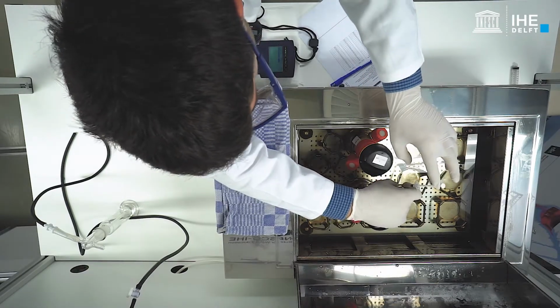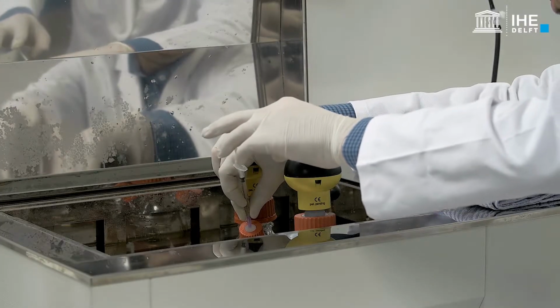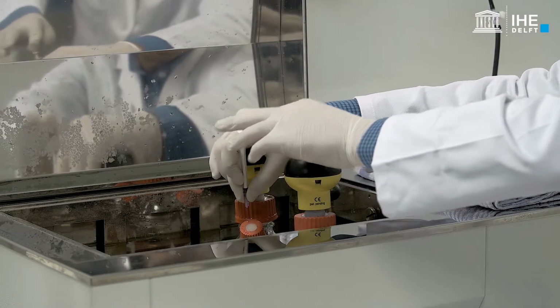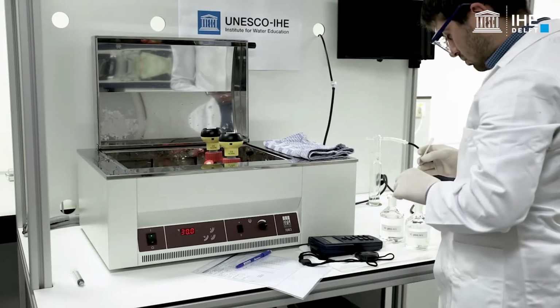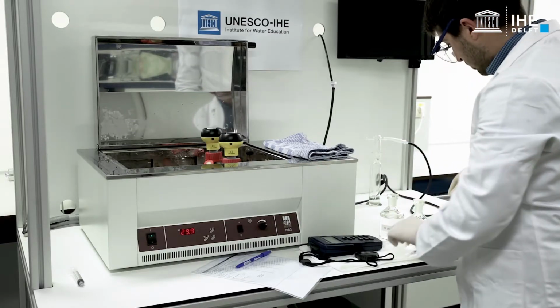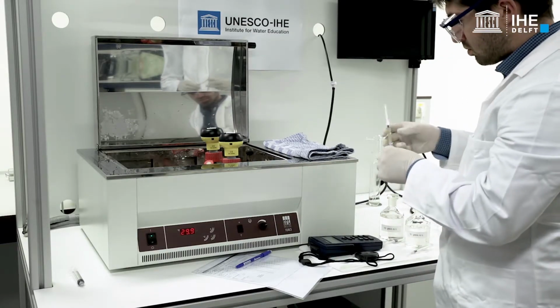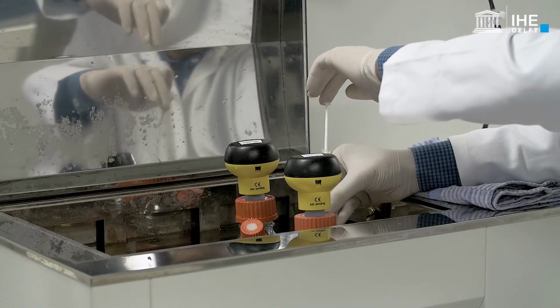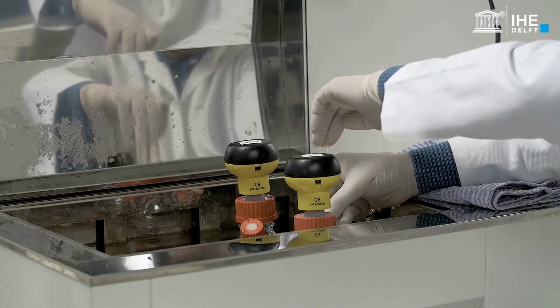2.4.3.6 of the textbook for choosing the right starting nitrite concentration based on the type of Anammox process to be studied. In this example, 1 milliliter of each substrate solution was added to the reaction vessel in order to reach initial ammonium and nitrite concentrations of 50 milligrams of nitrogen per litre.